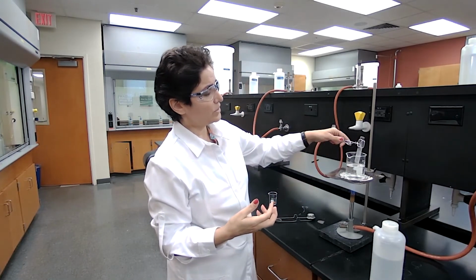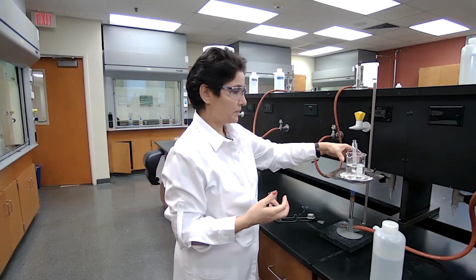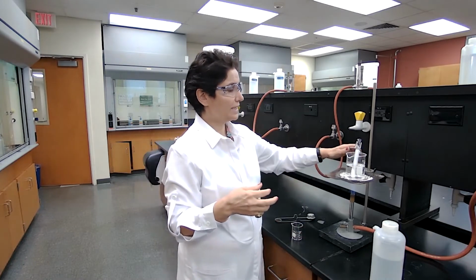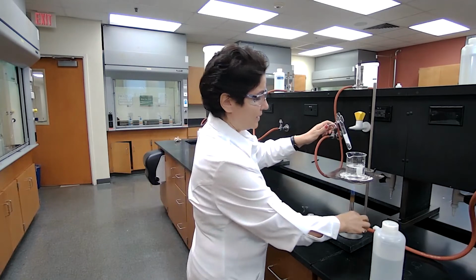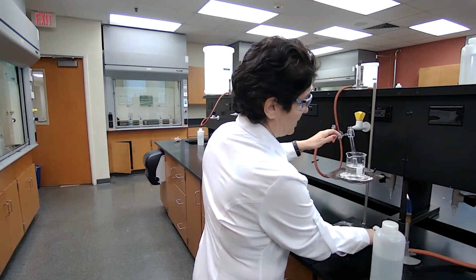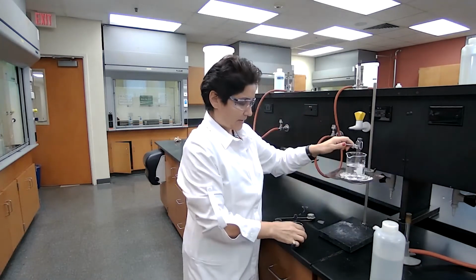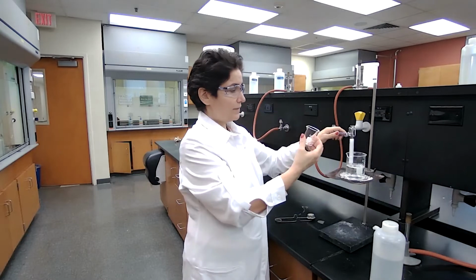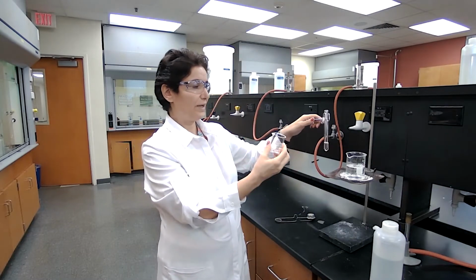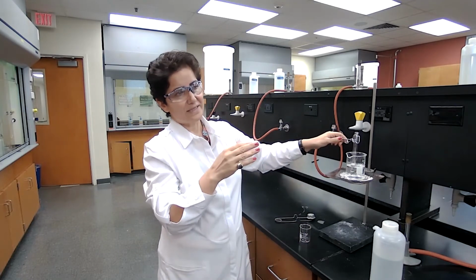So what we can do, we can take it out and place it in a beaker. The procedure is actually asking to detect the odor. You take this and you place it in a beaker of warm water. Why does it have to be warm water? Because if it's cold water and this is kind of oily, it can just freeze. The temperature of the water should be between 60 to 70 degrees.